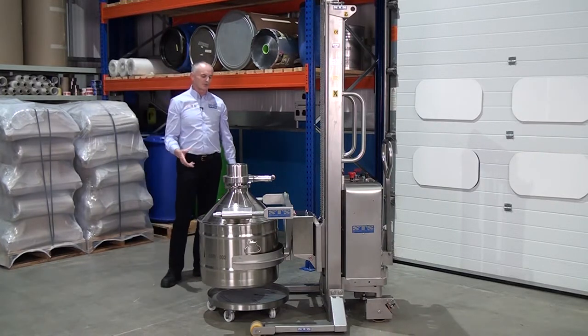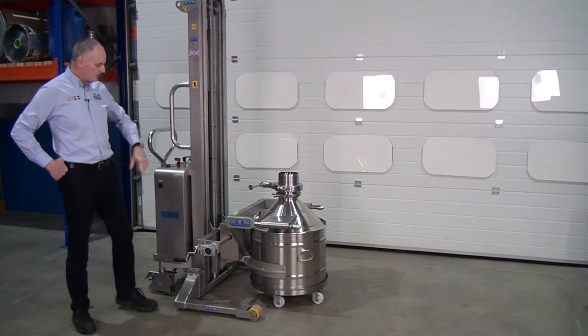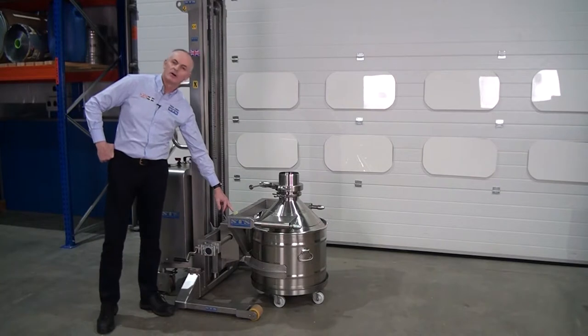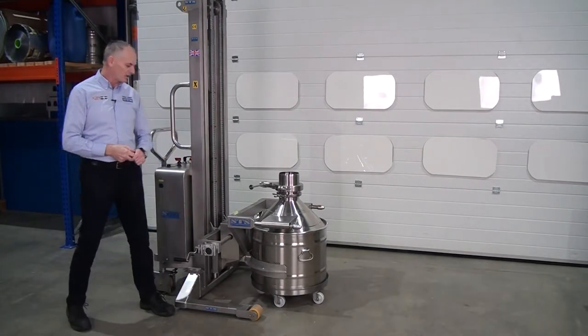What we'll do now, we'll do a close-up and show you the rotation mechanism. The next thing is we can adjust the head this way or that way by turning the handle. There's a level bubble on the head, so make sure the bubble's in the middle, which shows you that you're absolutely horizontal.